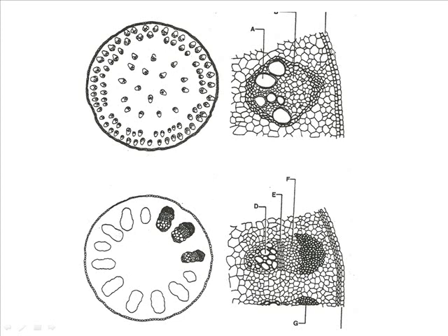What do we have here? We have on the outside epidermis. Inside that, at least for corn stems, you have a couple, three layers of what? Sclerenchyma. And then we have the vascular bundle. What's this tissue on the outside of the vascular bundle? It is sclerenchyma. These big guys are what? Xylem, or primary xylem. What is this in here? Primary phloem.